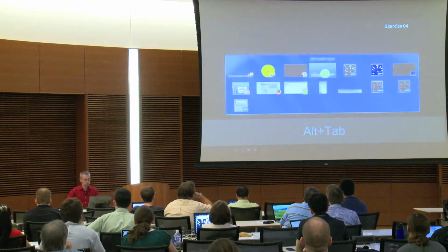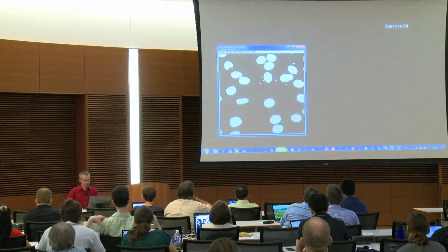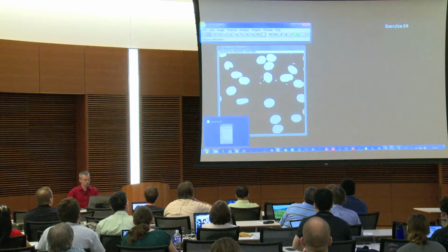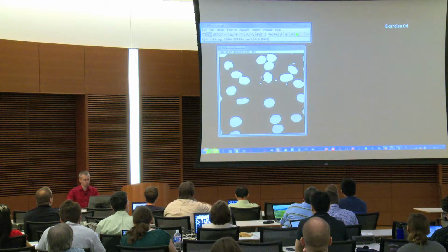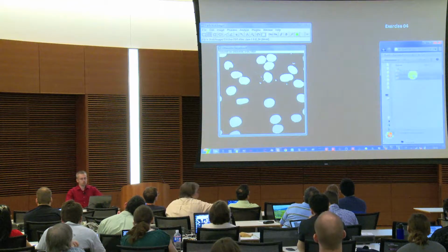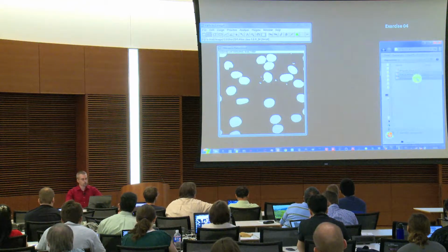So we can test first the erosion. Exercise 4. Therefore, we first take these 2 ones, nuclei binary and nuclei original.